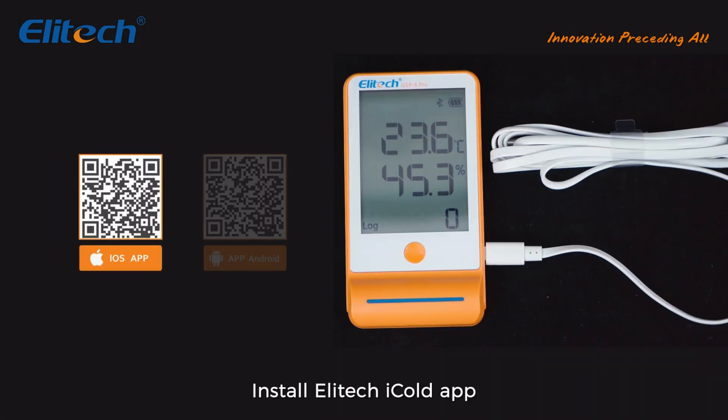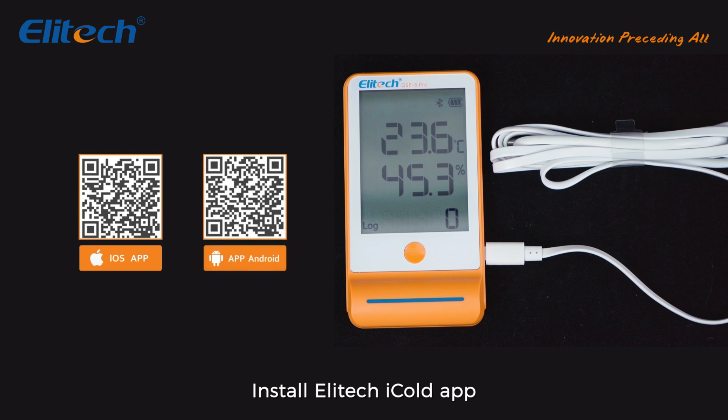Download the Elitech iCold app and follow the prompts to register and log in. You can set the recording interval, start delay, upper and lower limits of temperature and humidity, and temperature unit switch through the app.